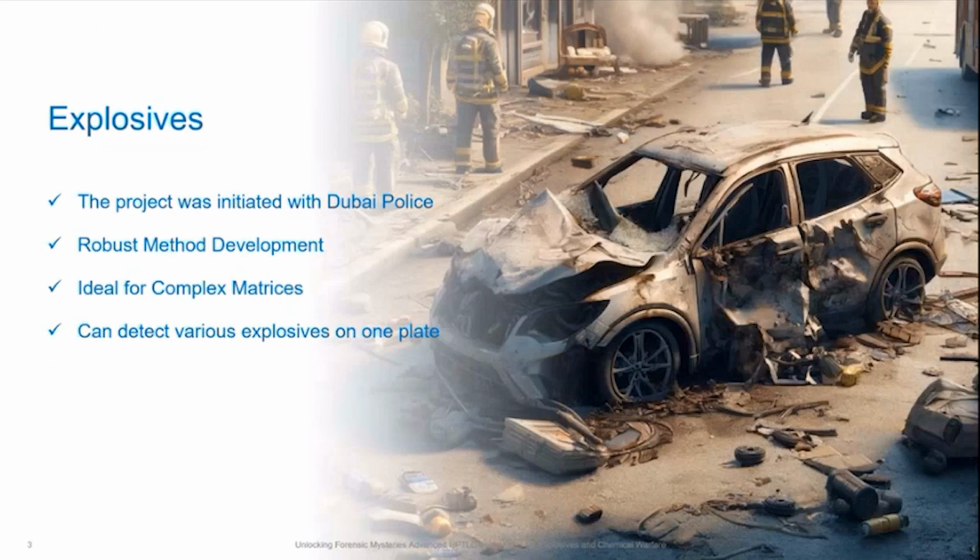So if we go to the first application with explosives, this has been elaborated and developed with Dubai Police. Dubai Police already had a TLC application for explosives. We brought it to HPTLC. They wanted a fully automated method. We transferred the existing TLC method to HPTLC, enhancing the robustness and reliability of the analysis. We are able to analyze explosives and novel explosives on one plate.